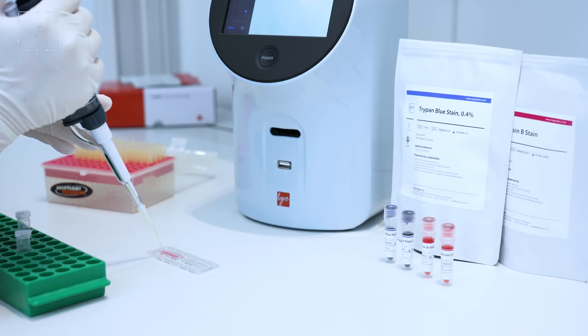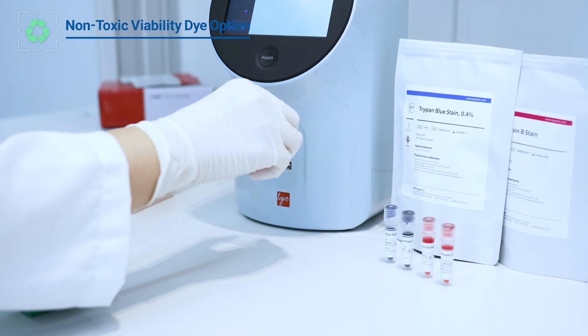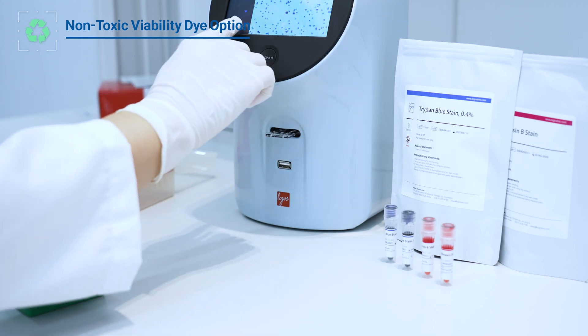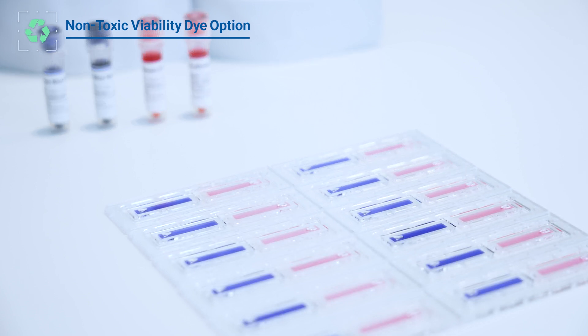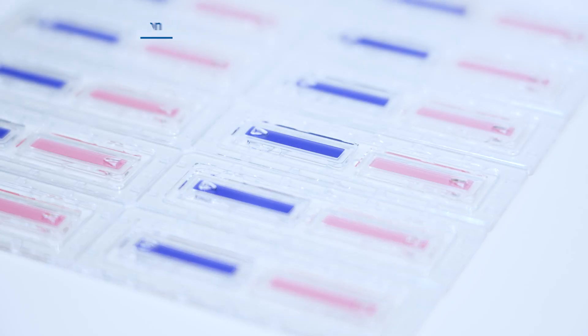Choose non-toxic erythrosin B for your viability assays to ensure safety and affordability. Optimized for precise cell counting without the need for costly fluorescent optics, it offers a cost-effective and safe solution. For your convenience, we also offer Trypan Blue as an alternative.